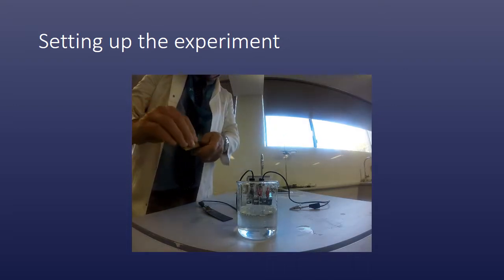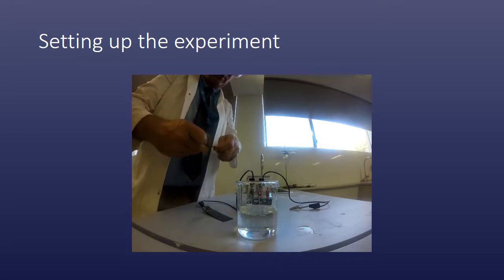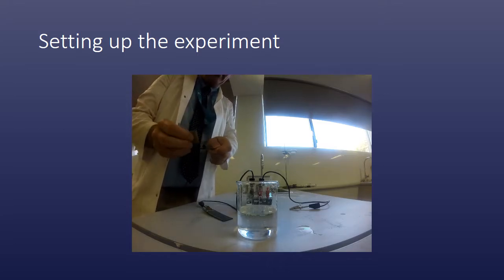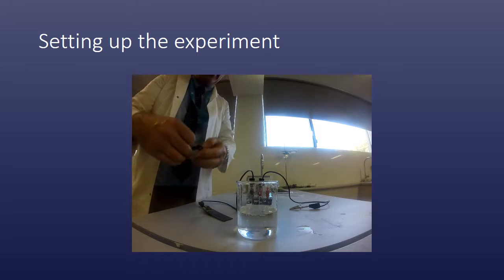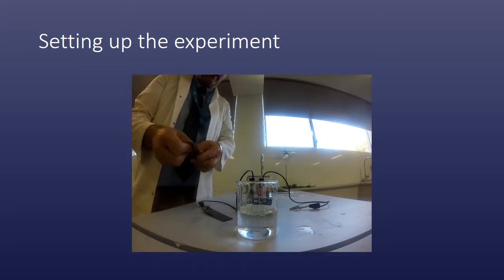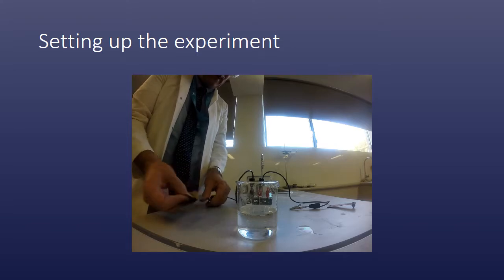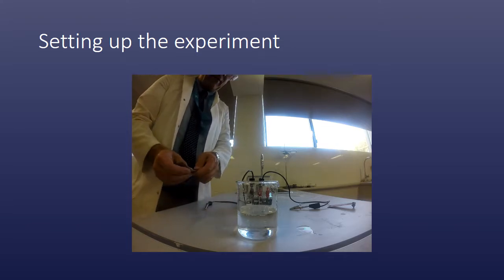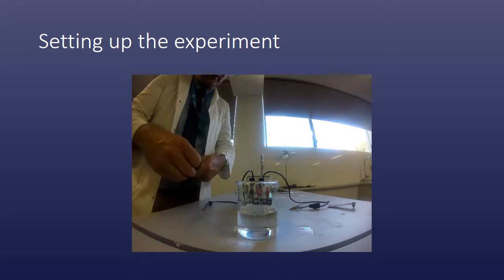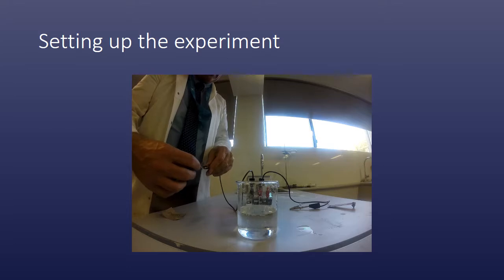I'm trying to complete a circuit here, and that's one of the keys to our galvanic cells. We're going to look at the application of galvanic cells as producers of electrical energy and how they relate to some of the batteries that we use as well. But we'll do that in later videos. For now, we just want to look at some of the different features of a galvanic cell and what sort of things we need in order to get them to perform optimally.